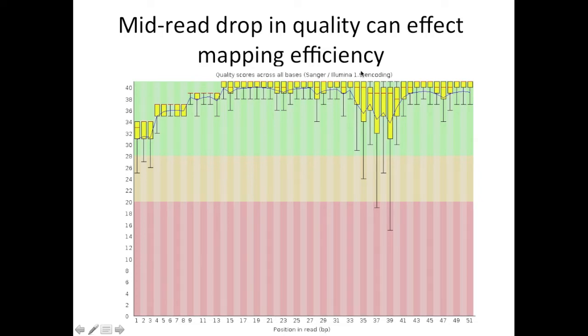You could filter out these reads that have low quality using a trimmer, which we will talk about at a later time. If this was a really bad drop and almost all of your reads had a drop in sequencing quality, I would consider going back to the sequencing facility. They should have caught a problem like that.